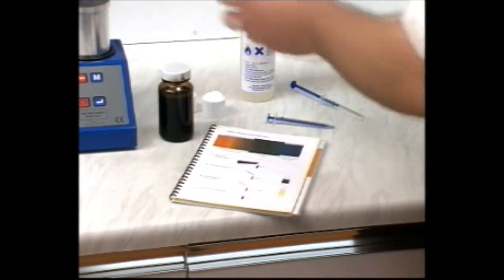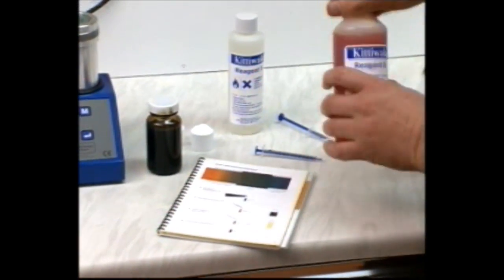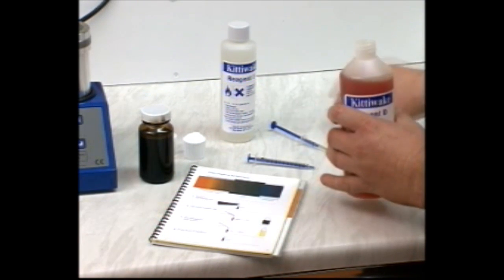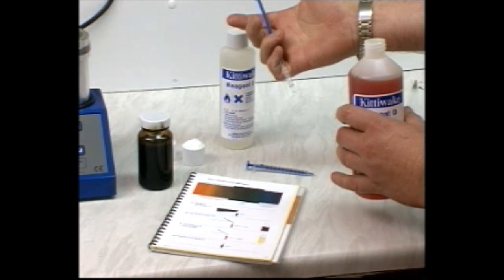Take the bottle of reagent D, which should be a blue-green color. If it is red, add reagent E one drop at a time, holding the syringe like this, until it just turns green.